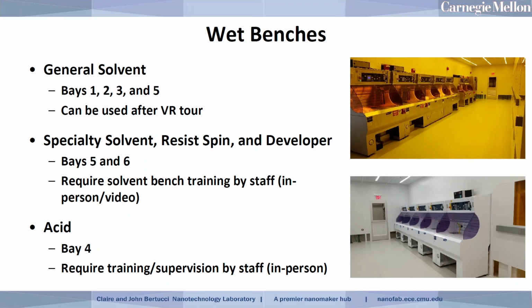The acid decks are the last category, and I should say acids and bases. We have, again, the 20 feet of deck space for acids and bases in Bay 4, and we can accommodate a variety of different processes on these benches. They have hot plates, some of them. They're all plumbed with DI water and nitrogen. We have a megasonic bath, a couple of heated baths.